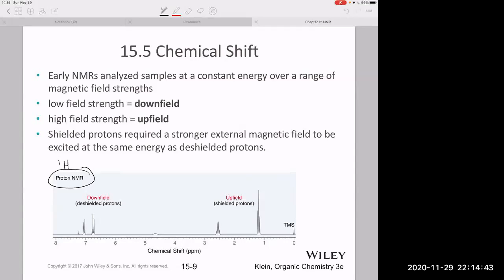So first of all, let's take a large view look at this here. On the bottom, you have chemical shift in terms of ppm. This is frequency, much like the frequency of a photon. It's always measured relative to this special compound TMS. Whenever you do these experiments, you have a little bit of this TMS in there that gives you a signal.